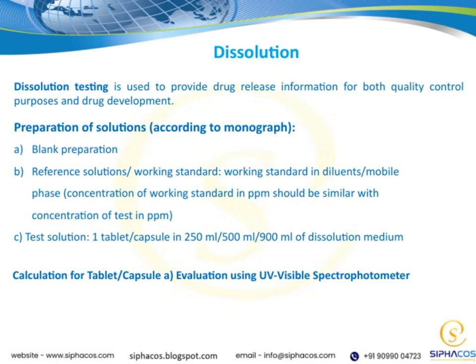For the test solution itself, we take one tablet or capsule and dissolve it in a specified volume of dissolution medium. This could be 250, 500, or even 900 milliliters, depending on the method. This step ensures we mimic the conditions under which the drug releases in the body.